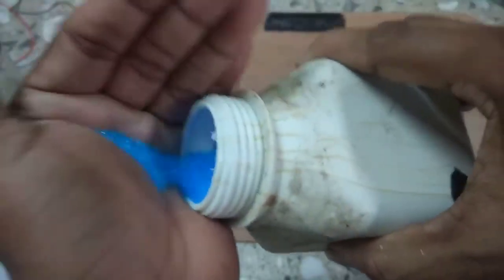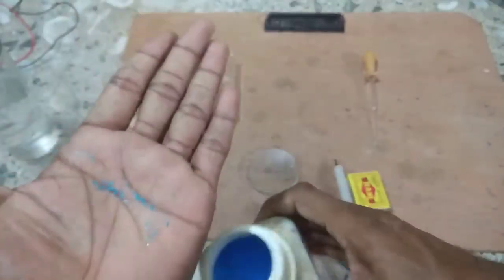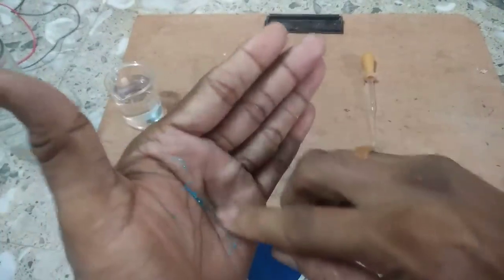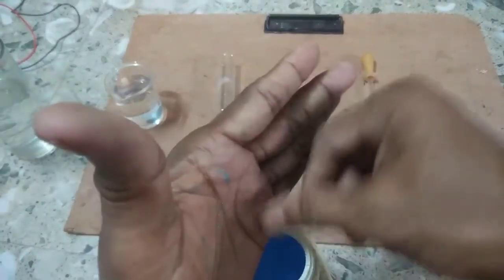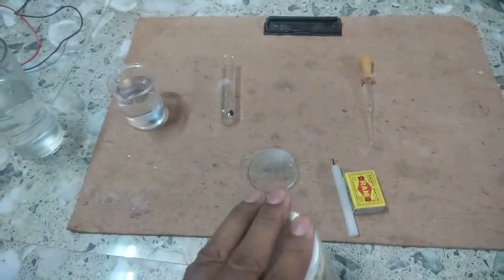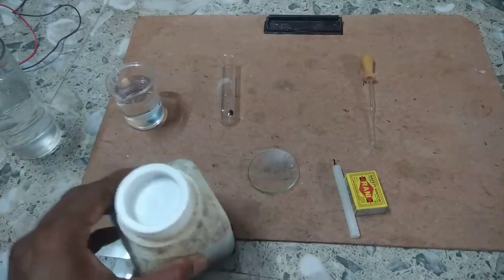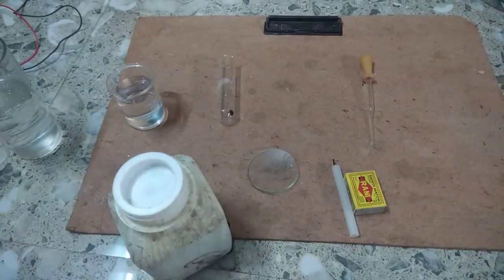And the formula for these crystals of copper sulfate is CuSO₄·5H2O. That means 5 moles of water of crystallization.